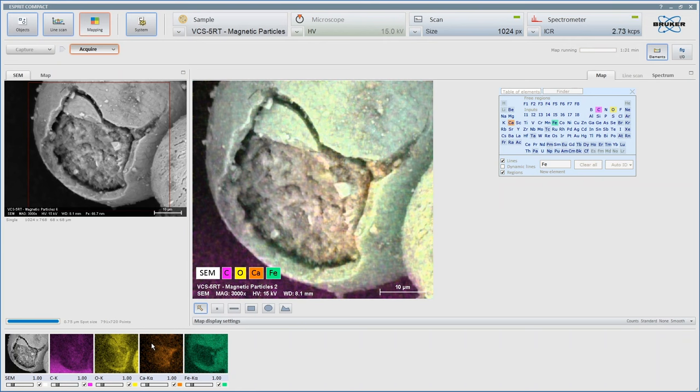Of course, it's seeing the bulk elements there. Now we know from the previous look at this that we have magnesium, silicon, aluminium, as well as calcium in the center here, but it's really picked out that the center core here is calcium in aggregate. Well, I'm going to pause the recording because it's just going to be doing a lot of sampling now.